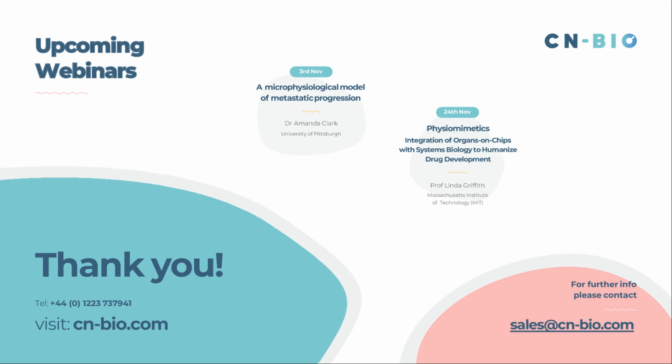Principally, our preferred scaling methodology is based around functional scaling. So how the function of organ A relates to organ B. Are they appropriate, and are the two cross-talking appropriately, rather than, let's say, more basic or more simplistic allometric scaling approaches, which often come across significant challenges as you scale down the size of organs. So we think very hard about that, and we have a number of tools to do that. We have a team of in-house bioengineers with a lot of expertise in this space.